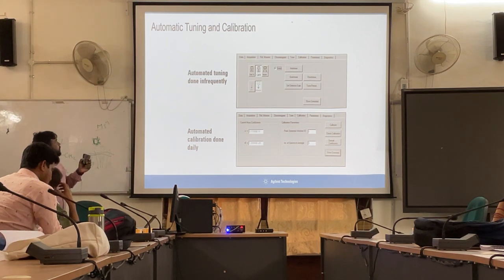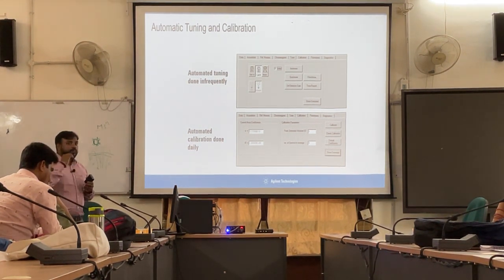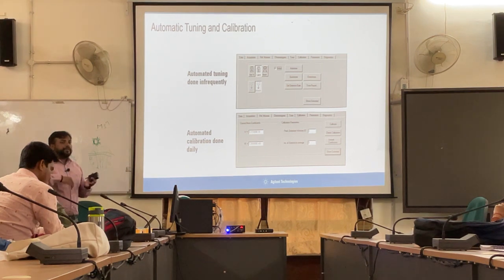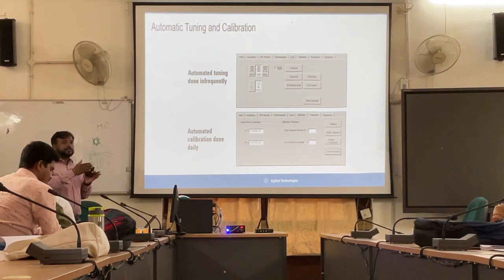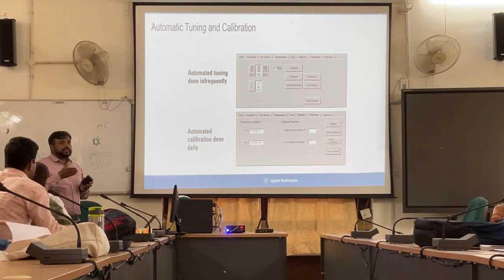There are different modes of tuning and calibration. Saurabh has said that one mode is tuning. In tuning we calibrate all the voltage parameters along with the TOF tune. In calibration, we do the quadrupole calibration as well as the TOF calibration. If your calibration is failing, it means the ions filtering from the quadrupole are not accurate, so to mitigate that we adjust the voltages.